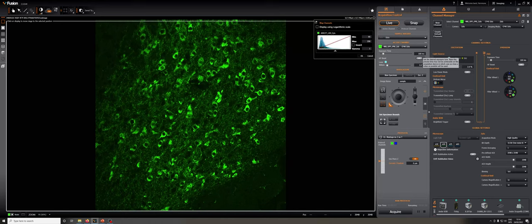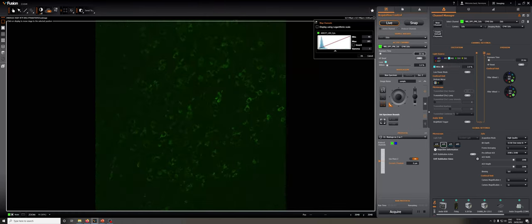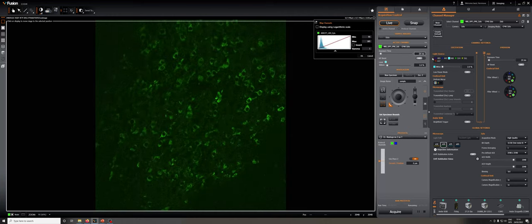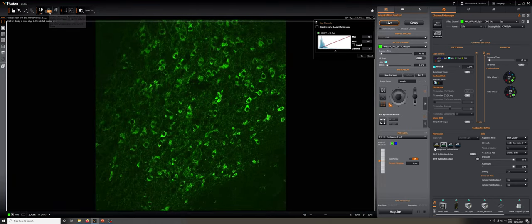So let's explore some of the options. If I lower the exposure down to 10 milliseconds, you can see this looks very noisy. The reason the image did not get dimmer is because we have auto contrast on. If we remove auto contrast and change the exposure, we will see the intensity of the image change. So it can sometimes be convenient to have auto on so that the brightness doesn't change, and we can evaluate quality by looking at the graininess or noisiness of the image.